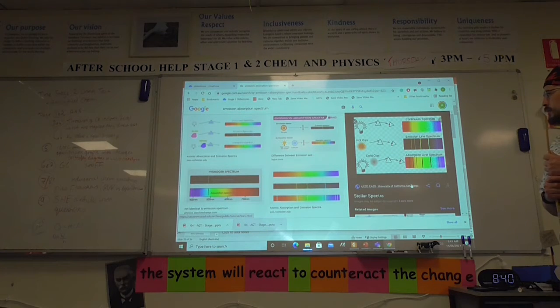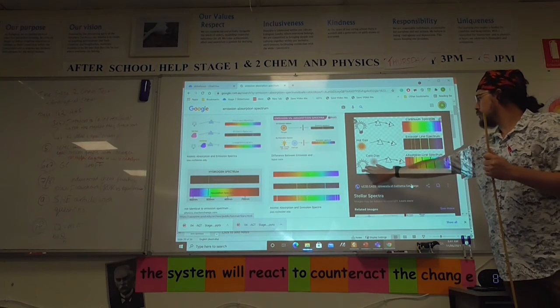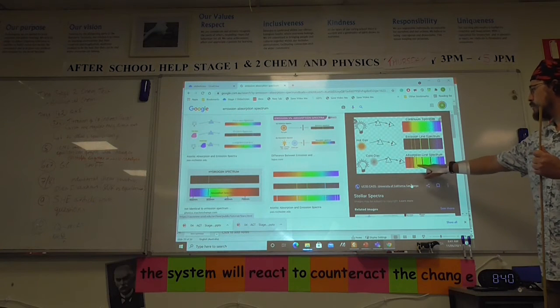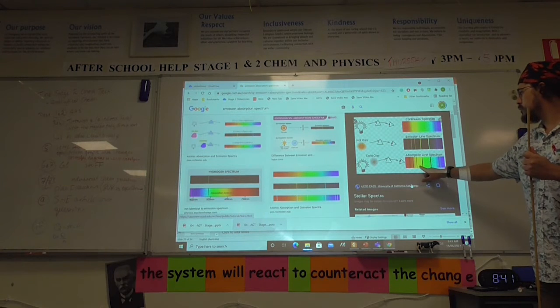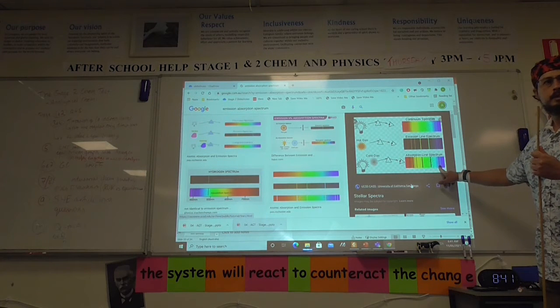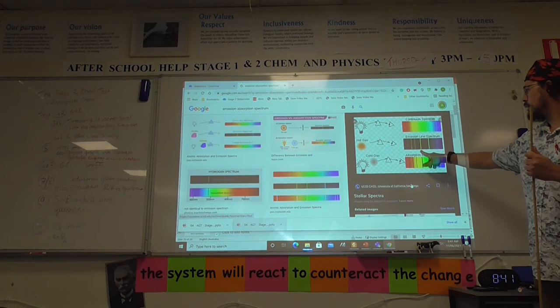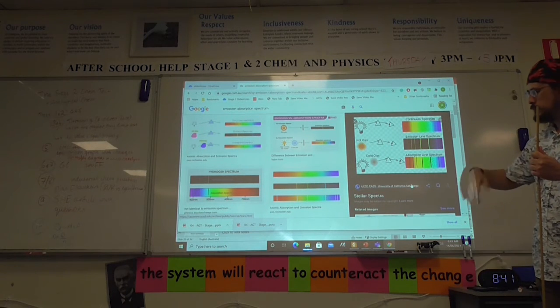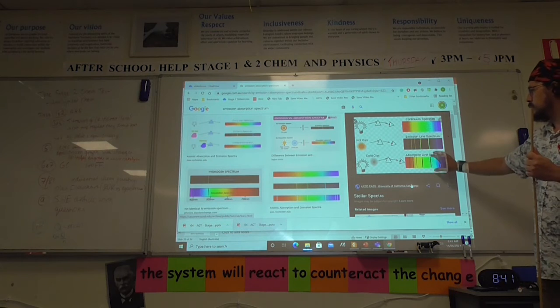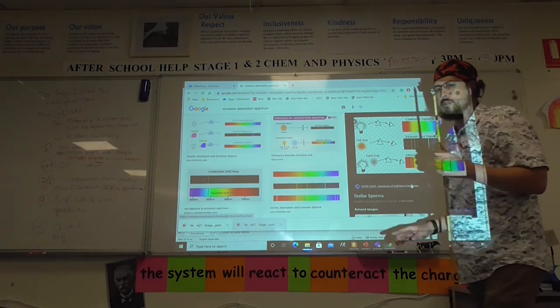Whereas if you pass the rainbow of light through the cold gas, what it does is it absorbs in the same locations. So that's where the light of the specific wavelength, such as red or this green, causes an electron to jump up and come back down from those energy levels. So it jumps up and it absorbs. So the emission and the absorption spectrum, they're one and the same. This is the one we're interested in for doing atomic absorption spectroscopy.